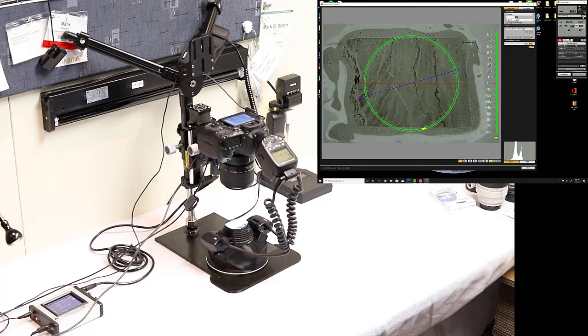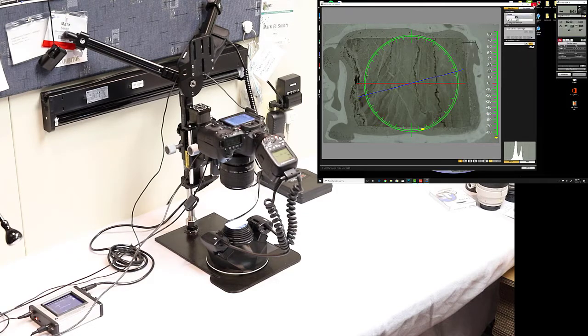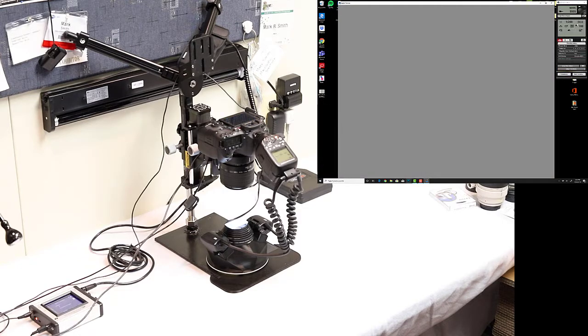Then we're going to set up the directory for where we're going to be storing our photographs. We changed the folder. The last tutorial we did was the Macrocore. Now we're going to move over to the Petrographic, and we created this high-res images folder. That's where we're going to select to store our images. We'll press OK. Then we're going to close our live preview, open up a quick preview, and we just want to fire a test shot.